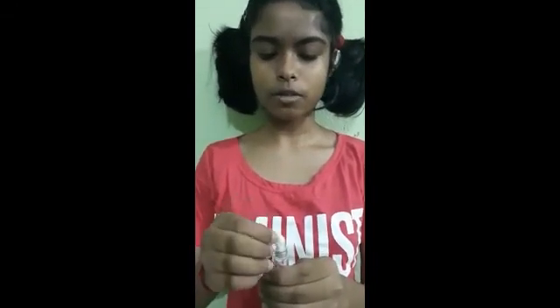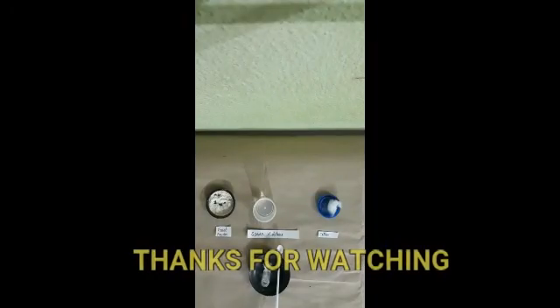Now after 3 to 4 hours, I am removing the cotton plug and I will smell it again. Now it smells like alcohol. The reason it smells like alcohol is because the solution was kept for 3 to 4 hours in the absence of oxygen. Now yeast grew in the sugar solution and produced an alcohol-like substance that time. So now it smells like alcohol. So this was the process of fermentation.